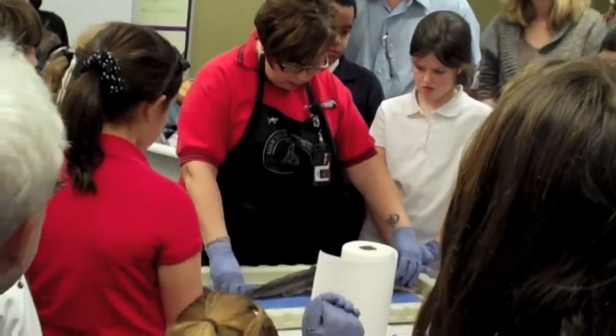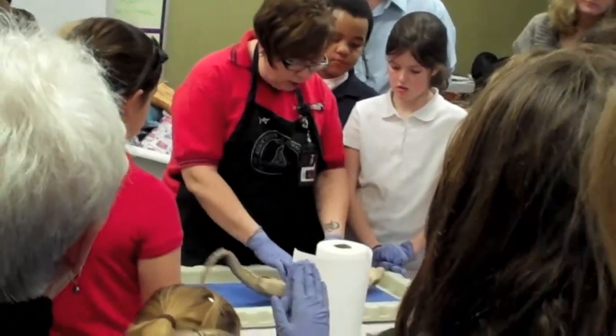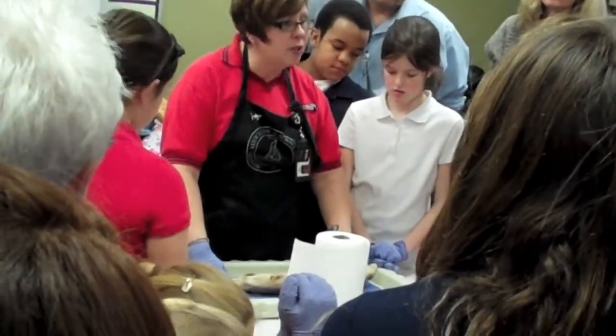Is this dorsal side or ventral side? Dorsal side. Okay, what side is this? Ventral. And what do you notice about color here? It's lighter. It's lighter. Adaptation, right?